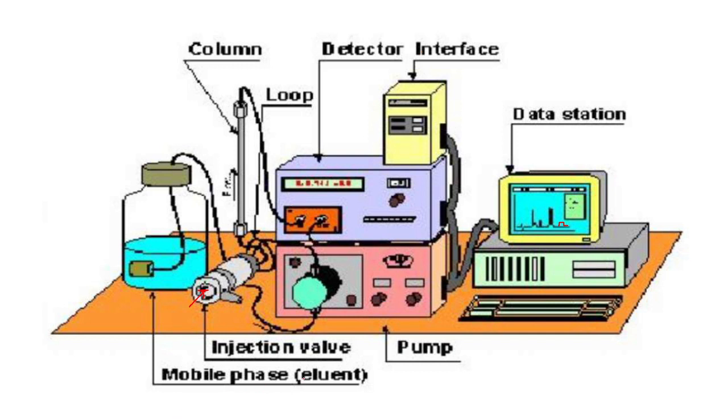You have the mobile phase, then your injection valve. Also we have the pump, which handles the flow rate. Then you have the detector, the interface, and the data station where you collect the data and save the data. Also with this you have a collection tube in which you would be collecting the samples or the separated compounds.